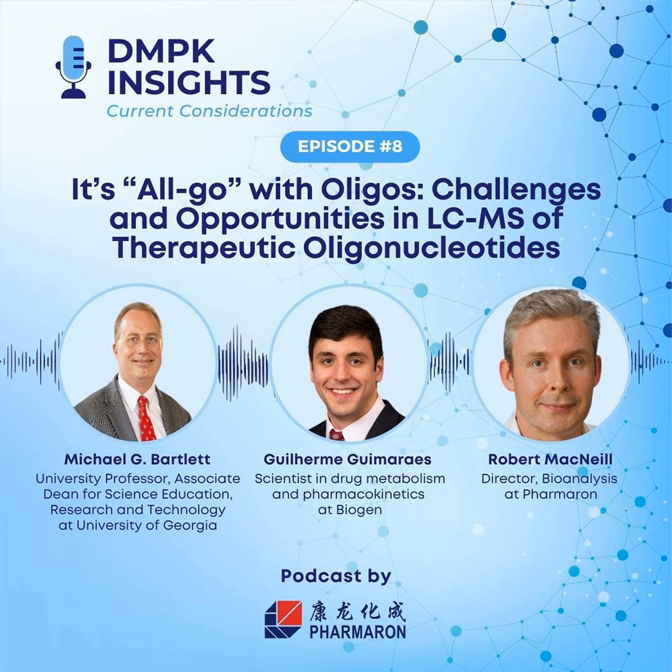But I think the big changes that have occurred more recently really is just because a lot more people have come into the field. Oligos have become a lot more popular as therapeutics. And with more people in the field, people have been willing to try different things. And so you're starting to see a rise in people trying new things like HILIC now.